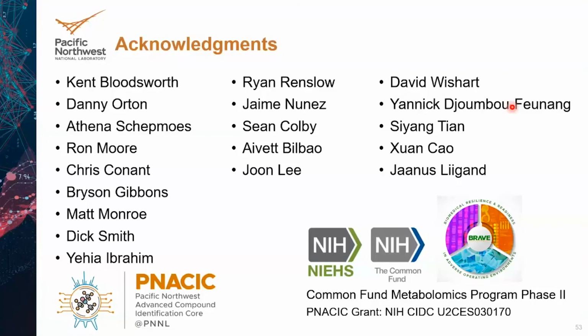CCS seems like a great measurement for in silico predictions because it is reproducible across different instruments and different labs. Retention time and MS fragmentation are still the most common measurements because IMS instruments are less common, unfortunately, and very variable. What is your perspective on the future of in silico predictions for reference libraries on these measurements?